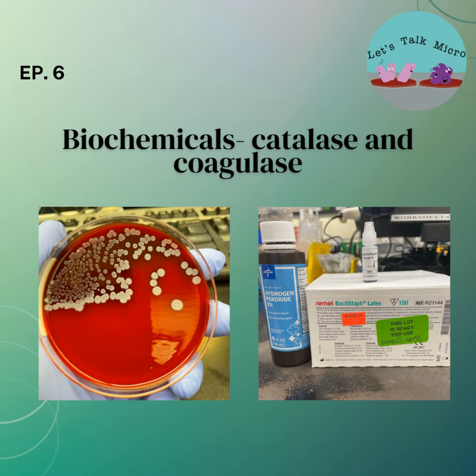If you have a catalase negative, gram positive cocci in chains, you go towards the strep. That brings us to our next biochemical, which is the coagulase. So this is used to differentiate between Staph aureus, which is positive, and other staph, negative.